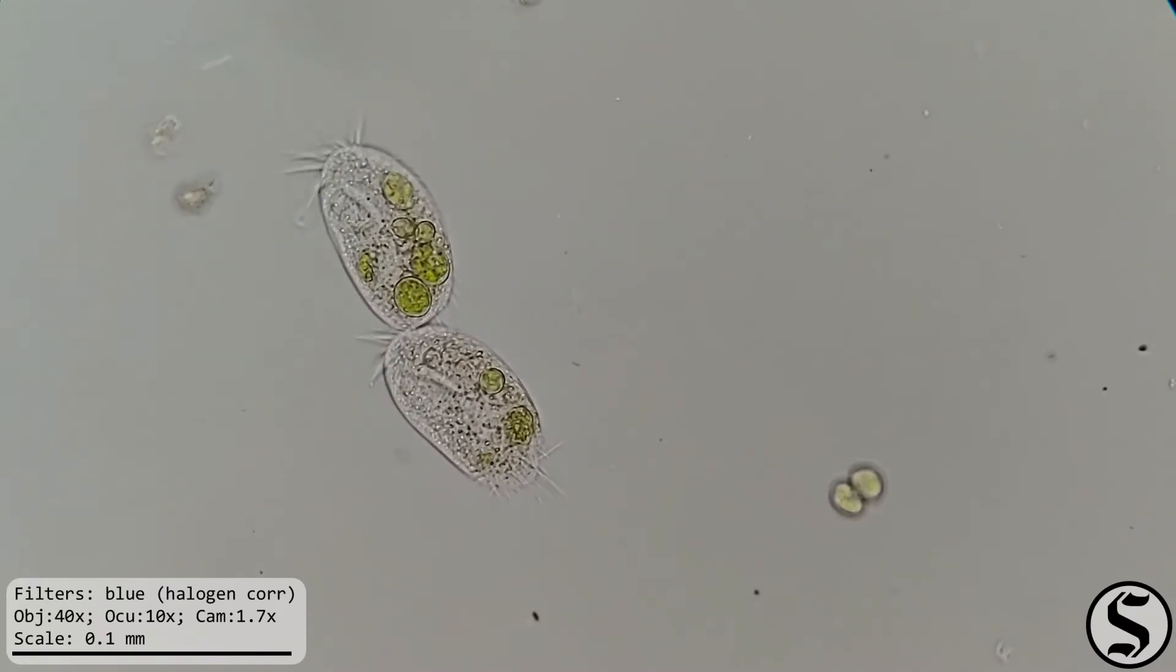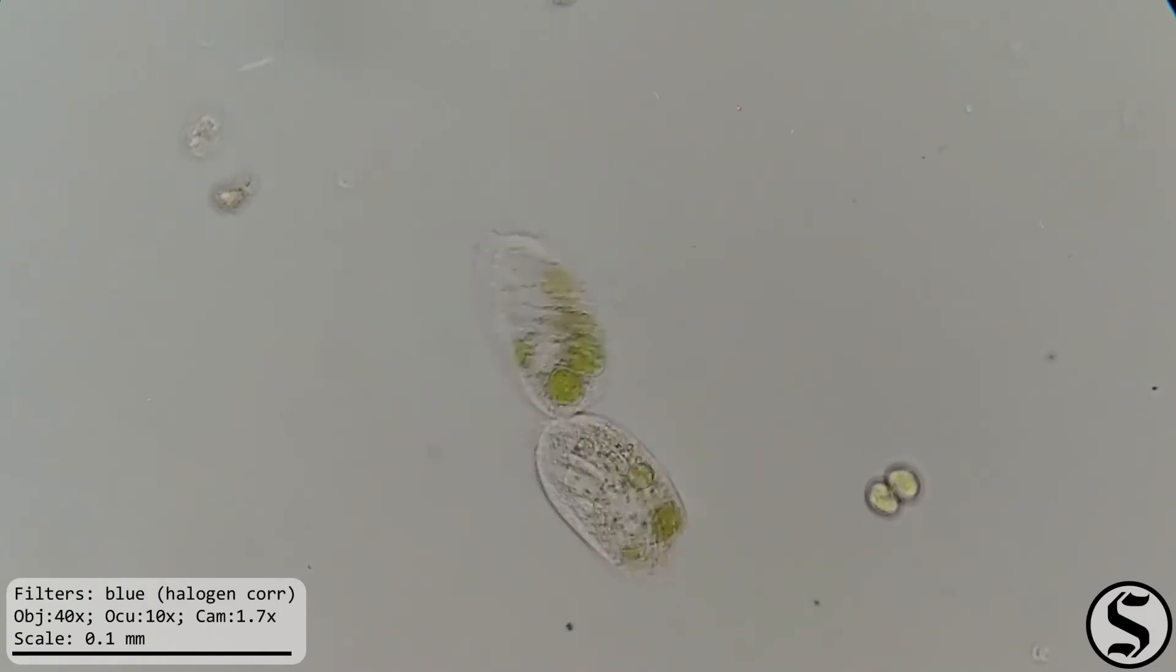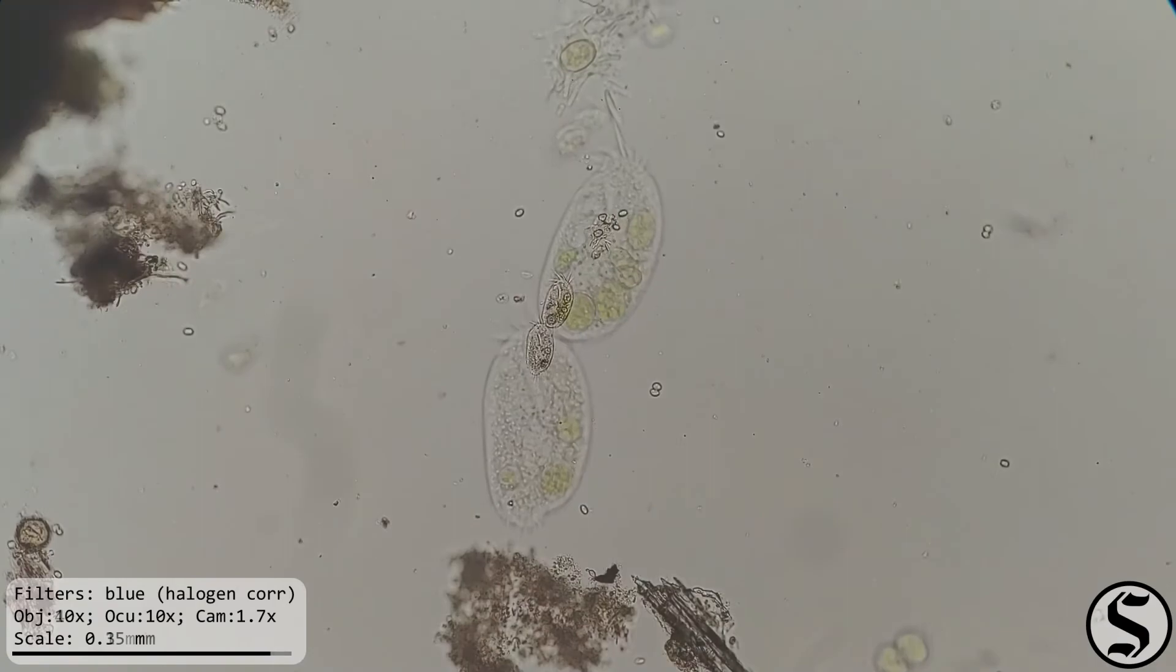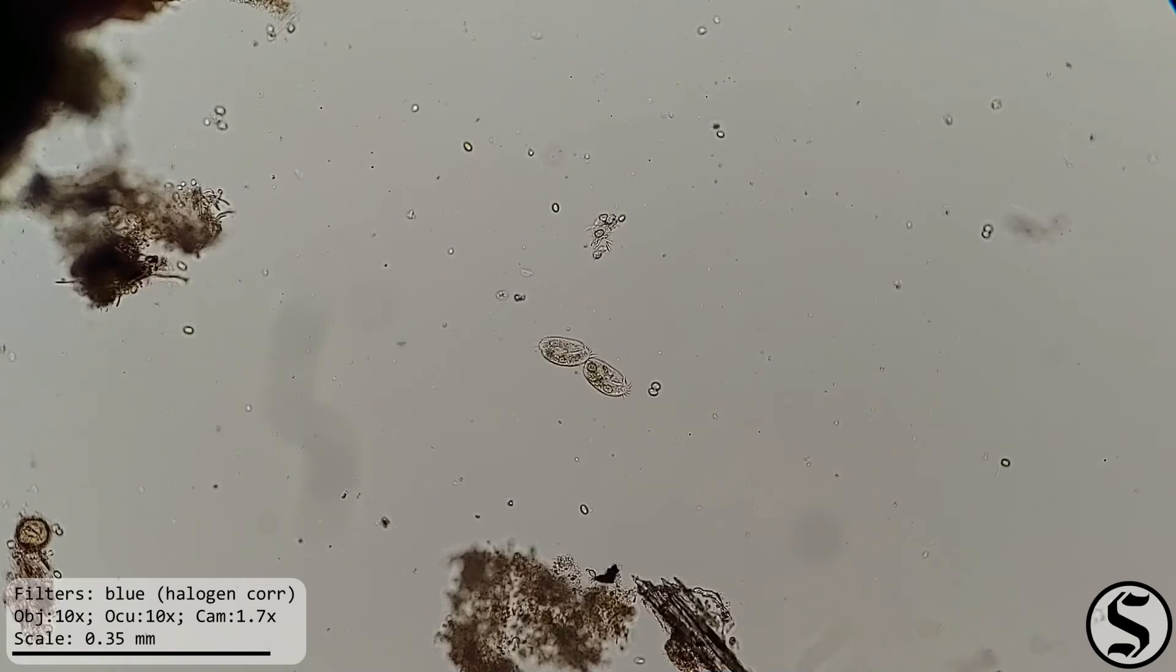At this point they are barely connected, and I felt like when they separated they were going to go flying apart, so I needed to go to a lower magnification. There's a full-size hypotrix that just swam by to give you a sense of scale on them.